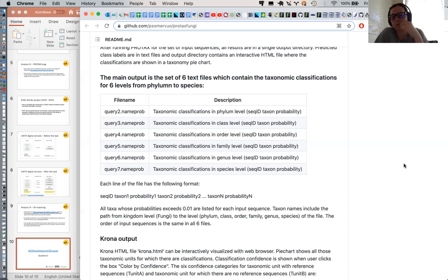These are available. Okay. And why don't you let people run, let's say, datasets of at least 50,000 representative sequences? Is it computationally too expensive, or because most of the high-throughput sequencing datasets are in the order of around 10 to 50,000 OTUs?